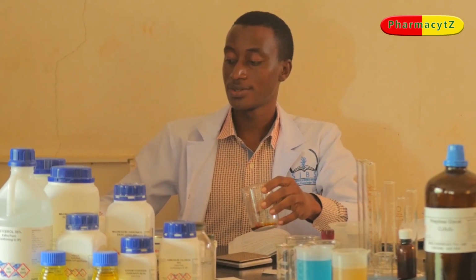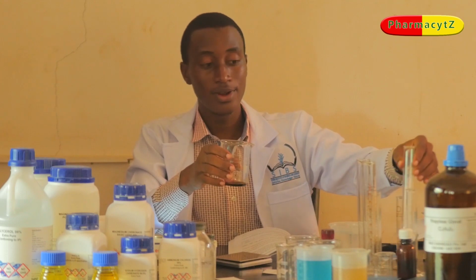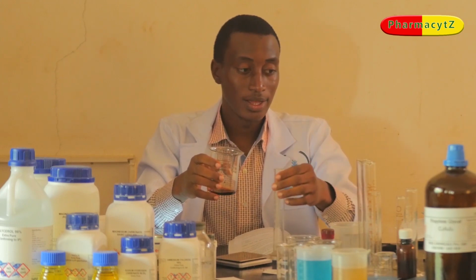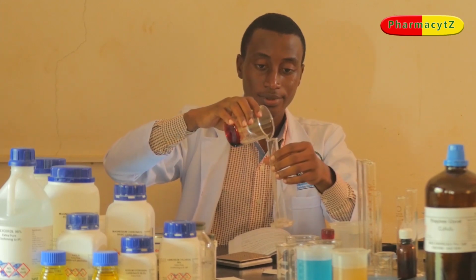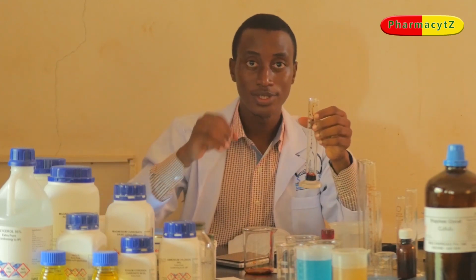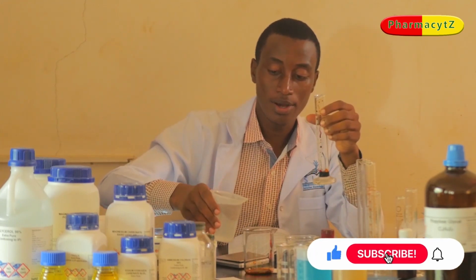Thereafter, you shift your product to the measuring cylinder to make the required amount of the solution. Mind you, we are making 20 mL of aqueous iodine solution. Now, by using the 50 mL calibrated measuring cylinder, we can measure this. Okay, so now this is less than 20 mL. Now we can add our purified water up to the required amount.